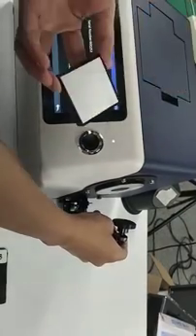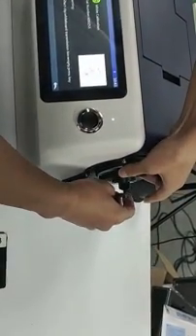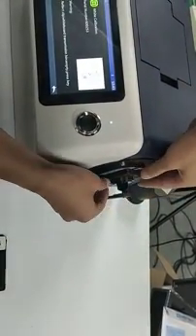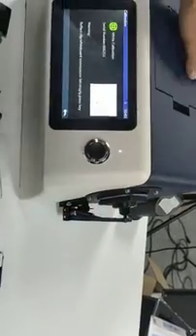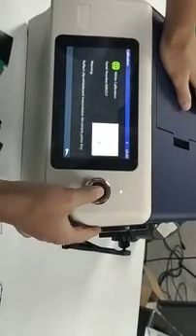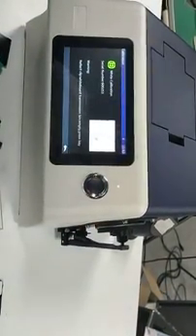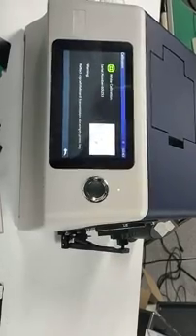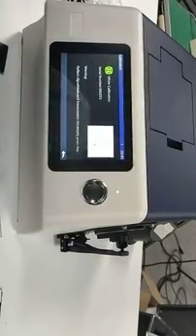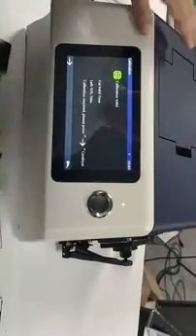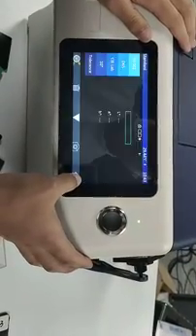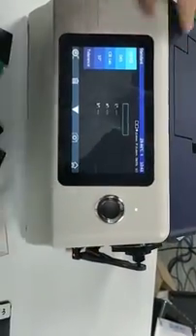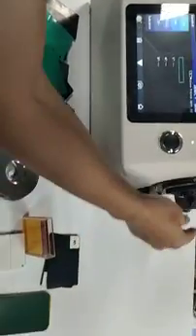White calibration. Press the button. Ok. It's done. First, let's measure any samples.